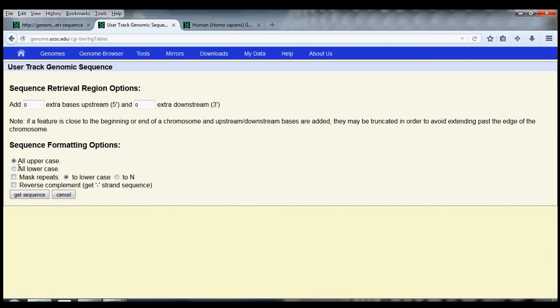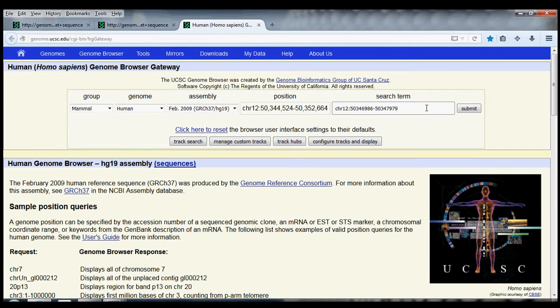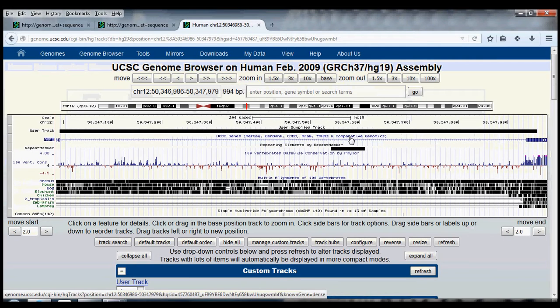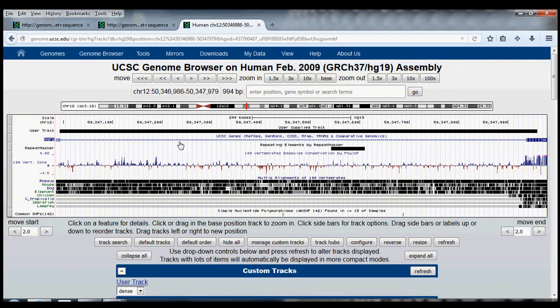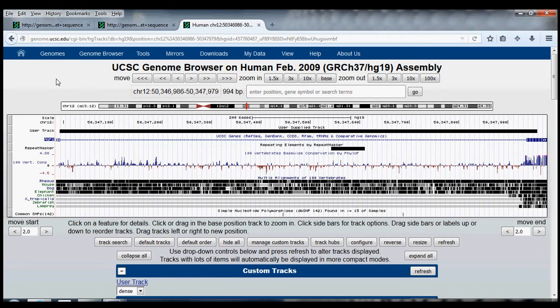This is just a formatting option — let's keep it in lowercase and we can get the sequence. So this is the much shorter sequence of that region of the aquaporin-2 intron that I was interested in. And just to make sure we got this right, let's copy this coordinate from the header of the returned FASTA file and submit it to verify. And it definitely is — we are inside the aquaporin-2 gene and in the 3' end of our intron of interest. The cool thing about making a custom track and then using the Table Browser is that you can use it to find any sequence in the human genome as long as you know the start and end coordinates.